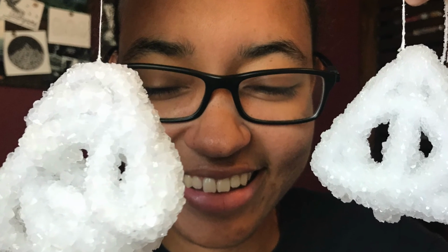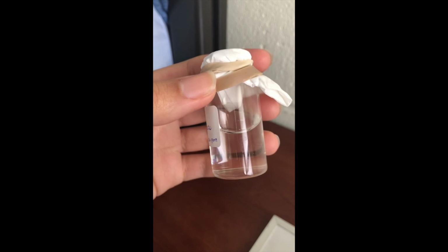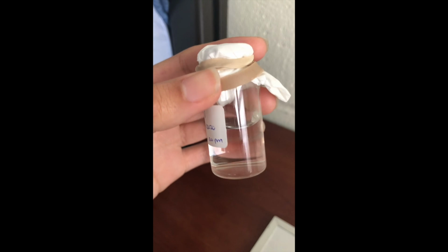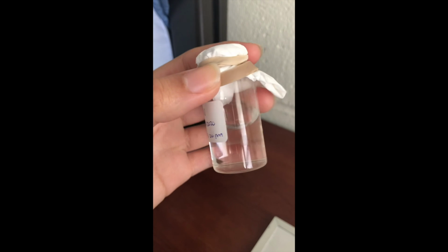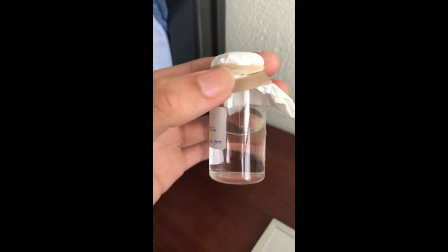So let's check on the crystals. Oh, well, there aren't any yet. That is because the solvent, which is water, is still evaporating very slowly, so the alum is still pretty well dissolved in it. And it's only been a few days, so hopefully next week there will be some crystals.